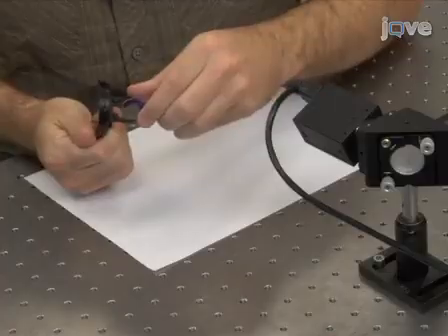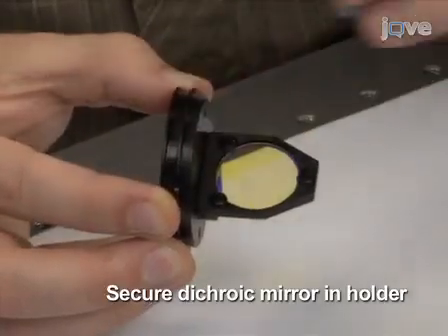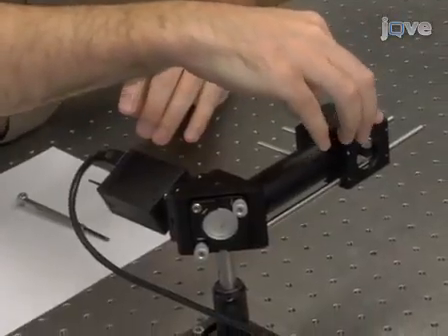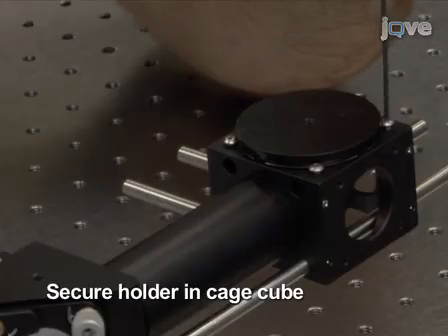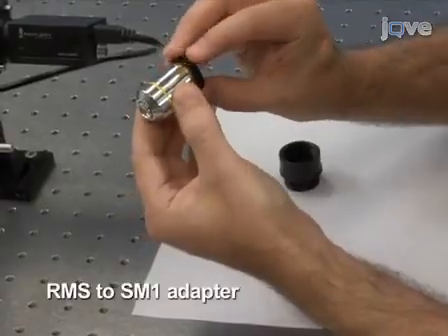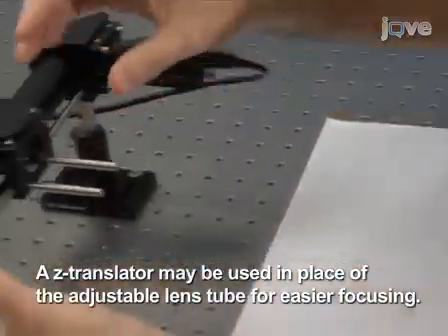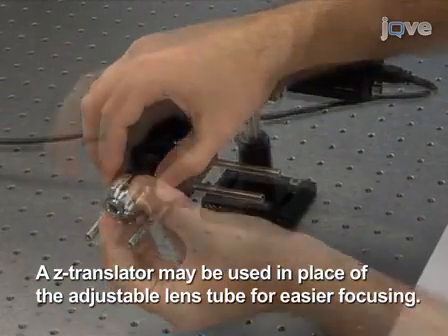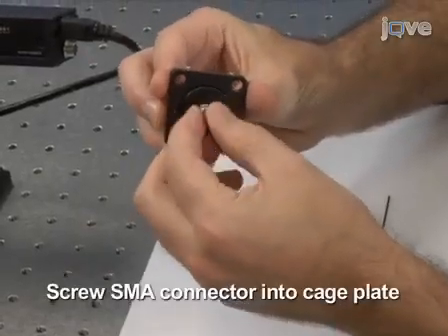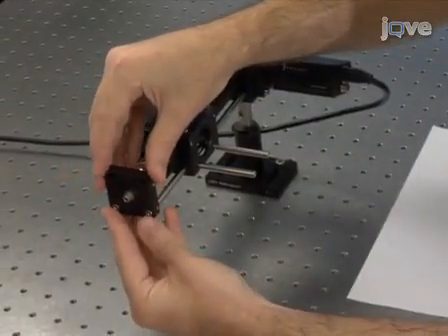Next, insert the dichroic mirror into the holder and place it at 45 degrees in the cage cube. Screw the objective lens via an RMS to SM1 thread adapter and an adjustable lens tube into the face of the cage cube opposite the tube lens holder. After that, screw an SMA connector into a cage plate and mount this on the rods, approximately at the working distance of the objective lens.